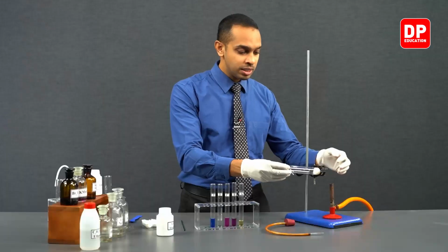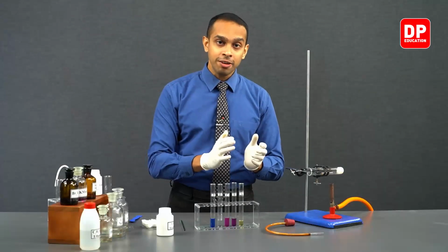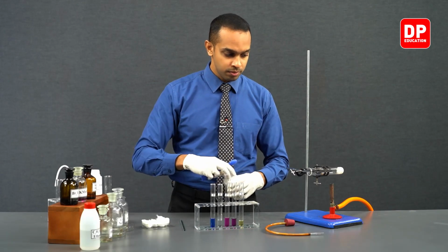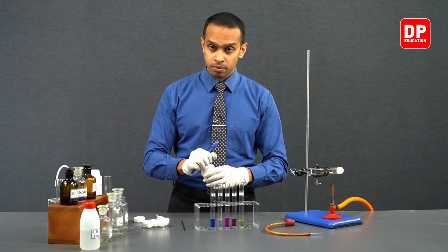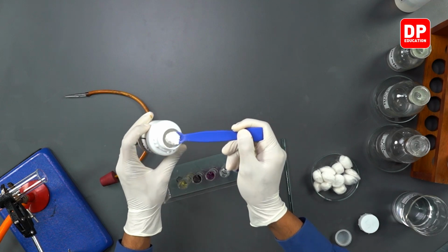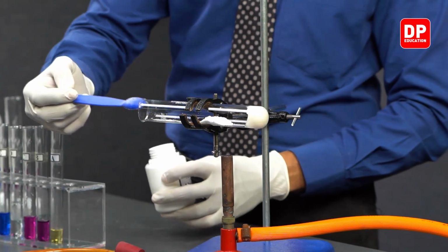So first of all, let's place this boiling tube in the setup that we have here. After placing our boiling tube here, we can move on to taking a small amount of alumina. Alumina is a white color solid. This is anhydrous aluminium oxide. We can place a small sample of alumina in the middle of our boiling tube like so.